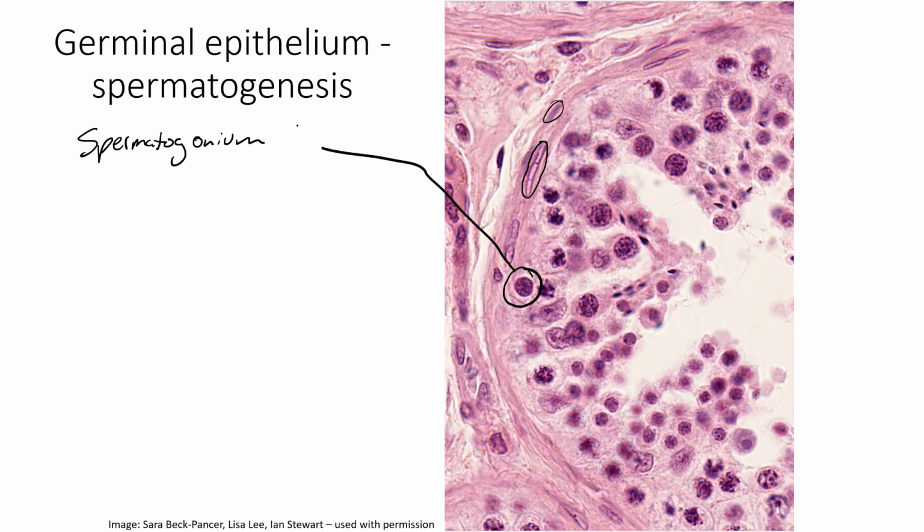And the spermatogonia are kind of like little spermy stem cells. A man of healthy reproductive age is producing sperm to the tune of hundreds of millions a day. And that's a lot of cells to be making. So if we're going to develop cells into sperm cells, we need to replace the ones that got turned into sperm. So these spermatogonia are constantly undergoing mitosis in order to replenish the cells that become sperm cells.